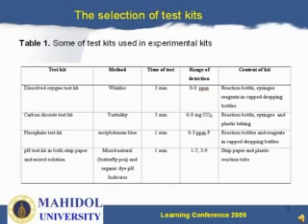The principle of this method is to find a reaction which specifically reacts with an element or substance, and detect the color generated from the reaction using a color scale. Some examples of the kits are the dissolved oxygen test kit, where we use the Winkler method for making the reaction.